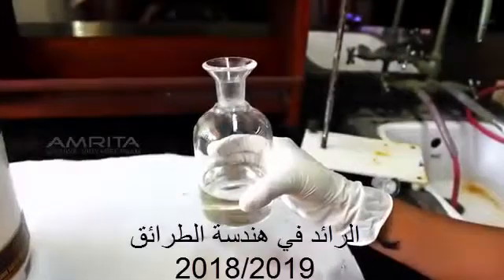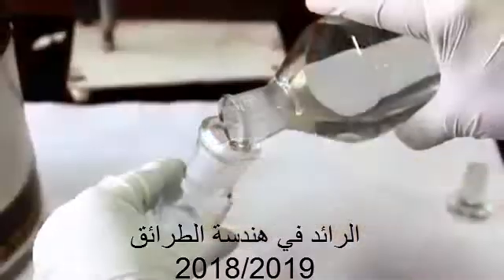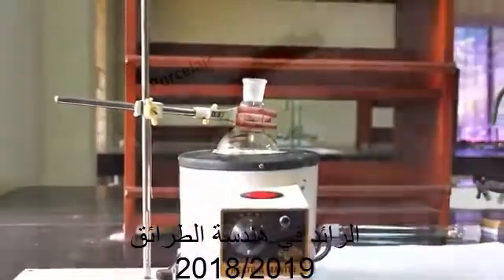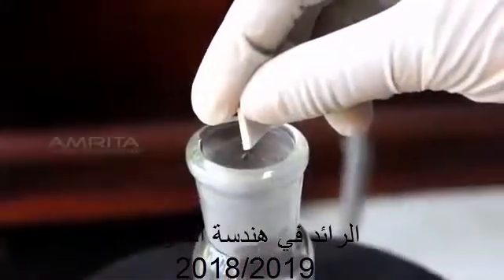Take a mixture of acetone and distilled water and pour it into a 250ml RB flask. Clamp the RB flask to a stand and place it in a heating mantle. Take some porcelain chips and put them into the RB flask.